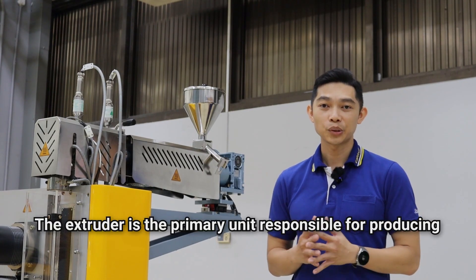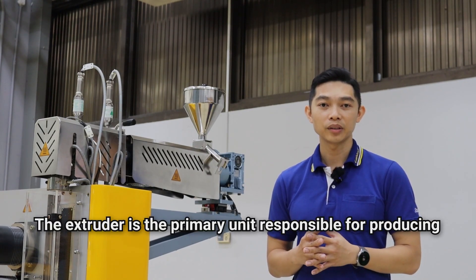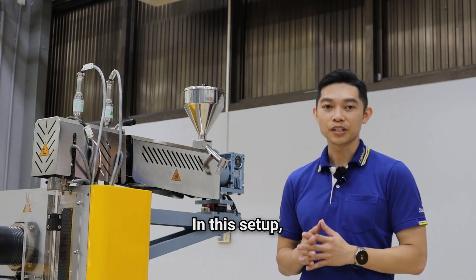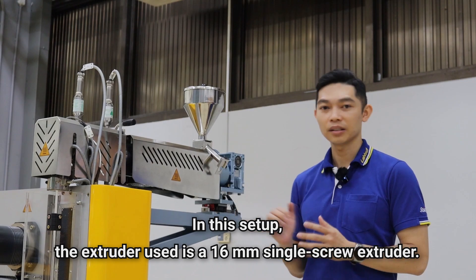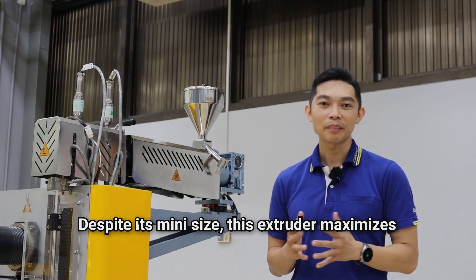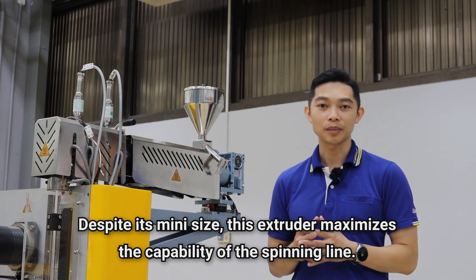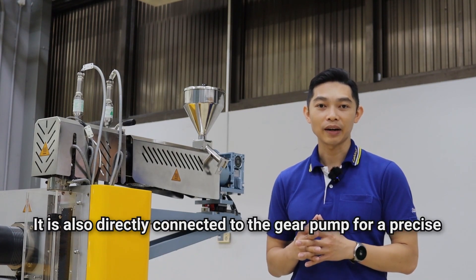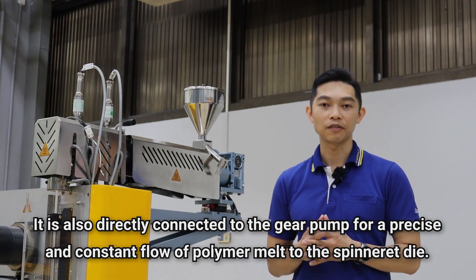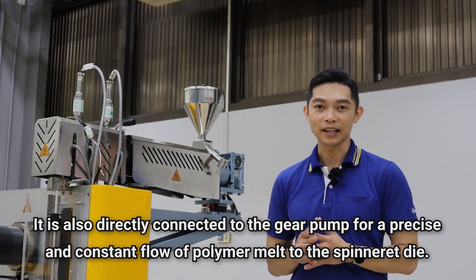The extruder is the primary unit responsible for producing uniformly homogenized polymer melts. In this setup, the extruder uses a 16mm single-screw extruder. Despite its mini size, the extruder maximizes the capabilities of the spinning line. It is also directly connected to the gear pump for the precise and constant flow of the polymer melt to the spinneret die.